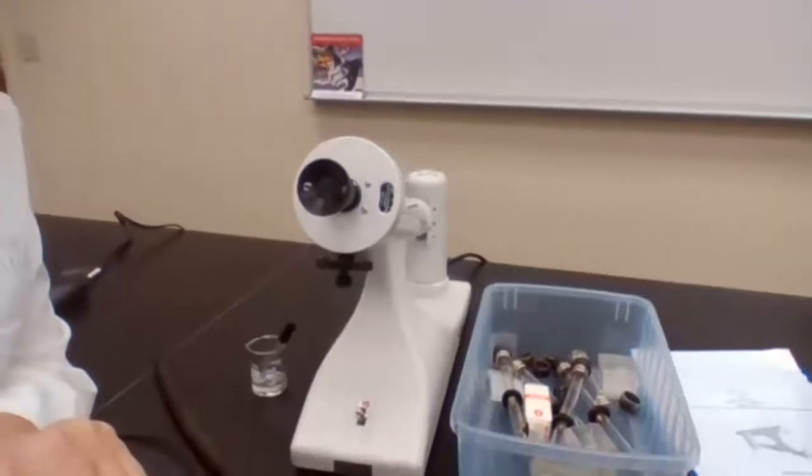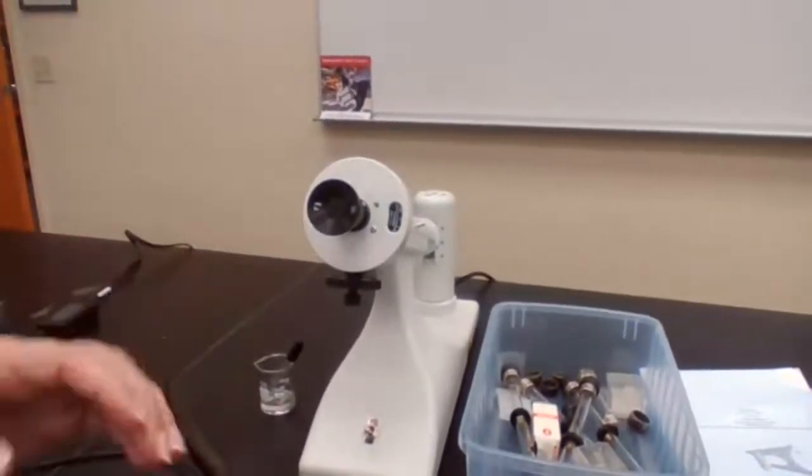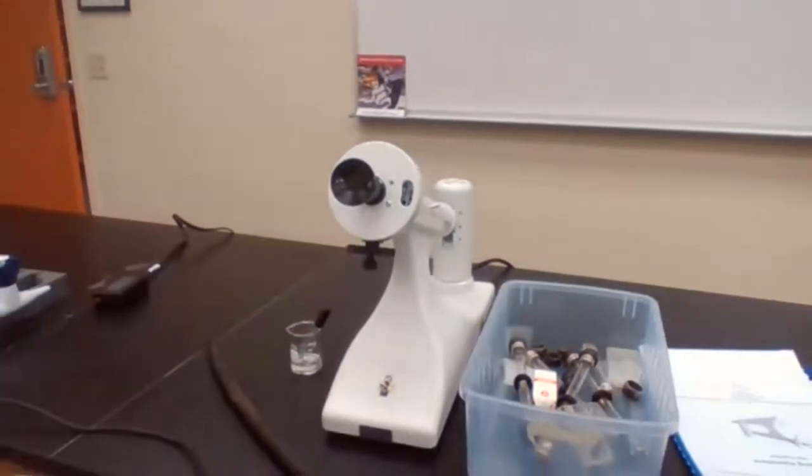I wish there was a way that you could see it, but there's really no way. It's a very tiny eyepiece here.